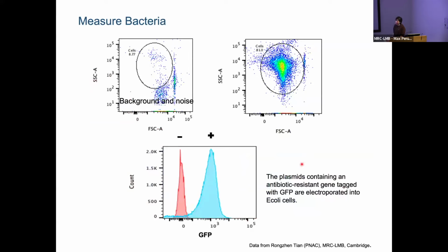We are talking about measuring mammalian cells, also archaea cells. Flow cytometer can also measure bacteria. Here we measure E. coli. The size is around 1 micron. Setting up the parameters is very important in order to exclude the background noise. Usually you will filter the buffer in which you suspend your bacterial cells. Cleaner is better.